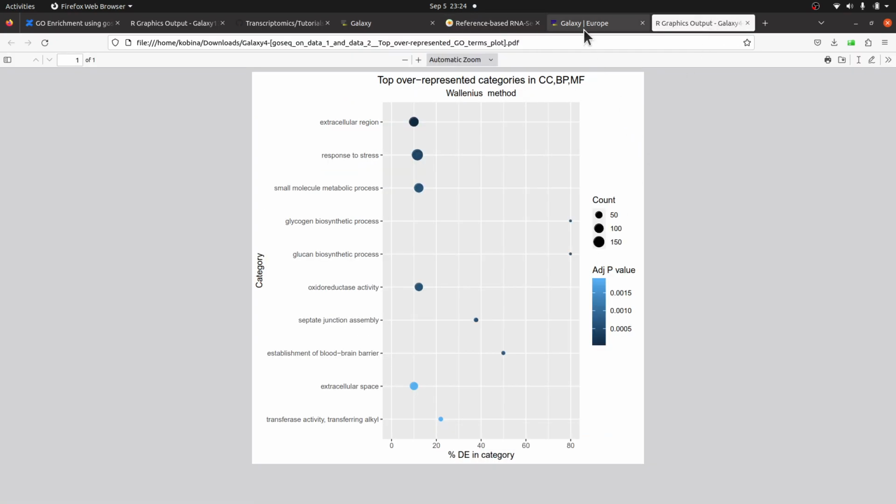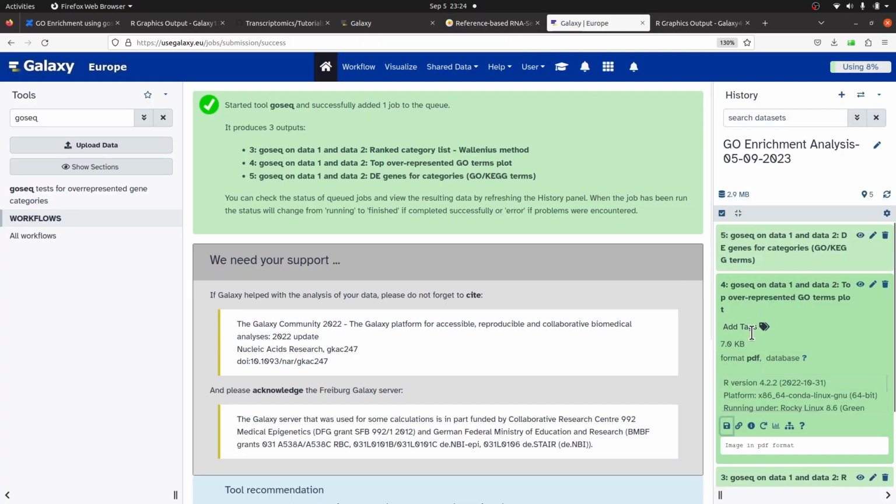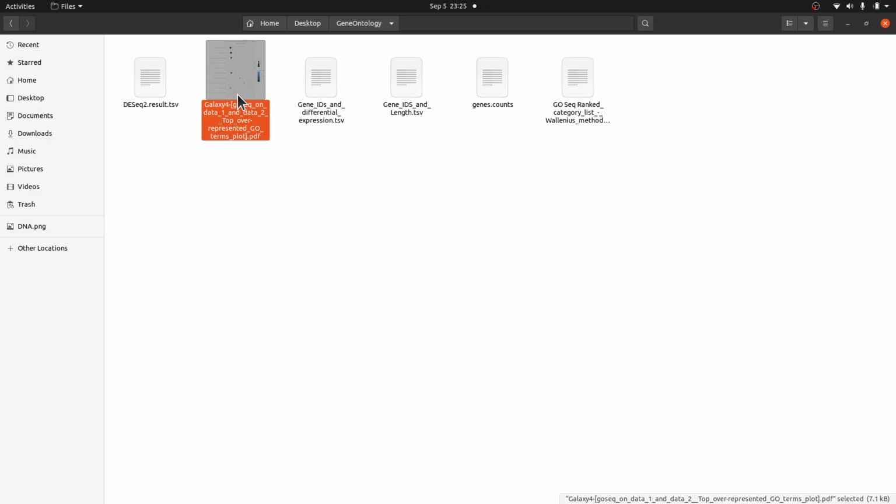And we also have this. This is a PDF. You can download it. Mine is already downloaded, so I can just open that. Let me just open it on my PC as well. So I'll check it out. There it is, so I can open it.